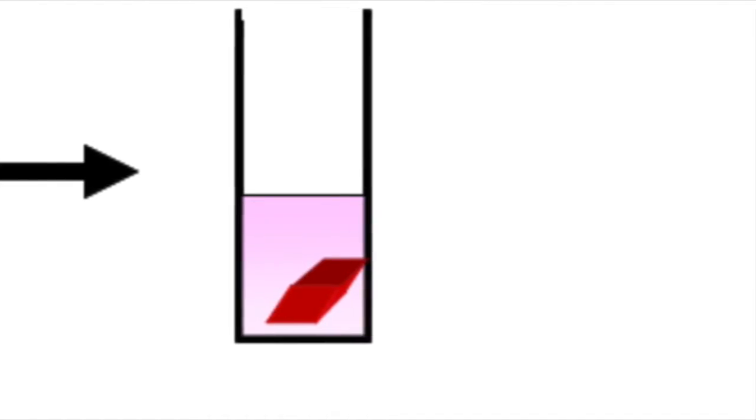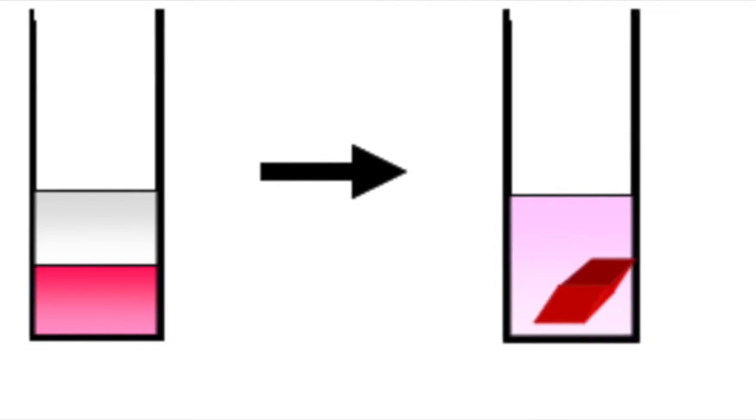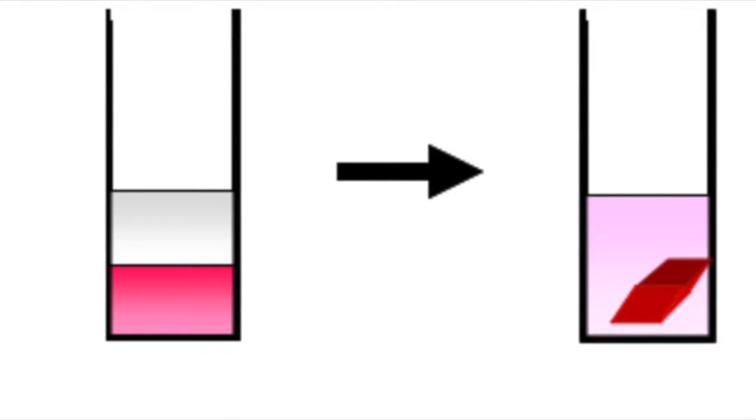Another method that can be used to grow a crystal is solvent diffusion. In this method, a dense, concentrated solution is poured into a sample tube. Then, a less dense solution is carefully dripped down the side of the tube to form a separate layer on top. Large crystals form slowly at the boundary where the solvents slowly diffuse.